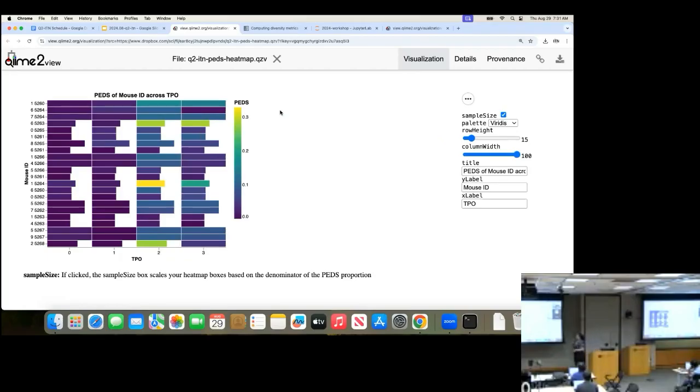But we kind of see, I'm going to point out 2 people as my star children in this study, and then 2 people as maybe my not as star children. But so here, 4 from the top, I can't reach it. That is probably our best engraftment and our most stable engraftment, as we can see. It looks like we have, not a huge percentage, about 20 out of 70 microbes from the donor engrafted. So not a huge percentage, but we do see that it's kind of stable in its engraftment. It maintained those, which is awesome.